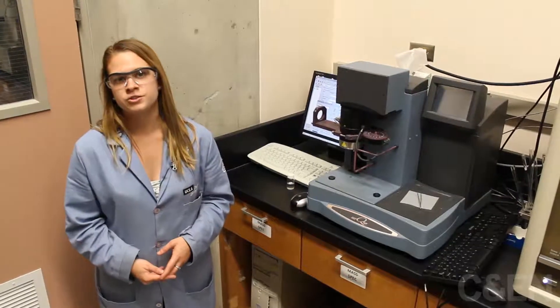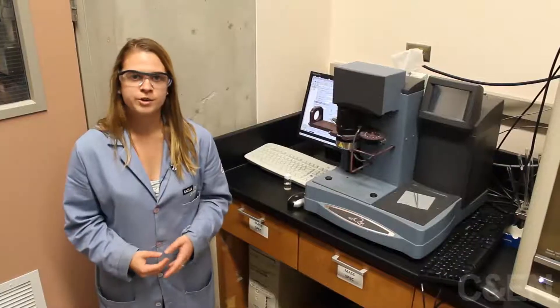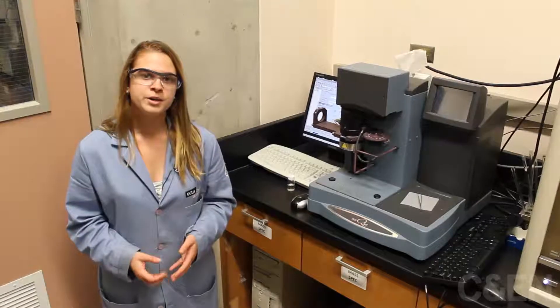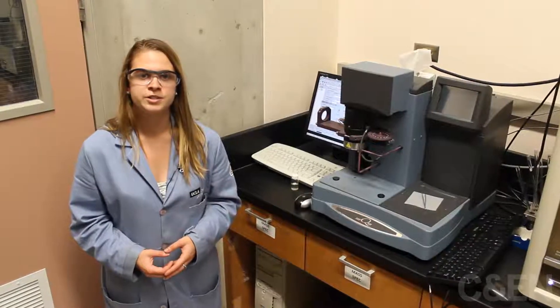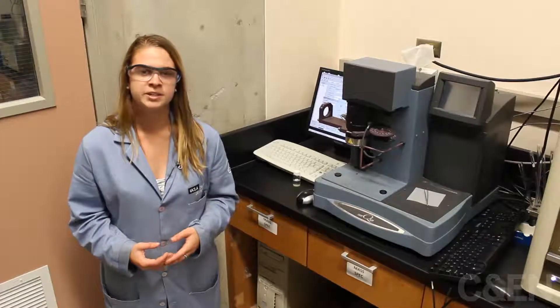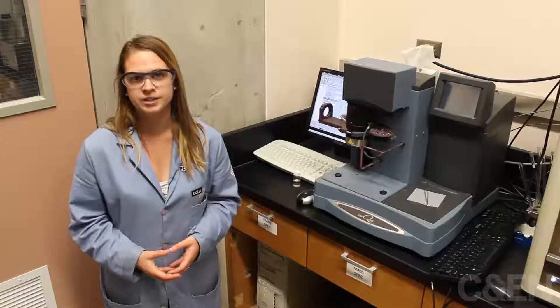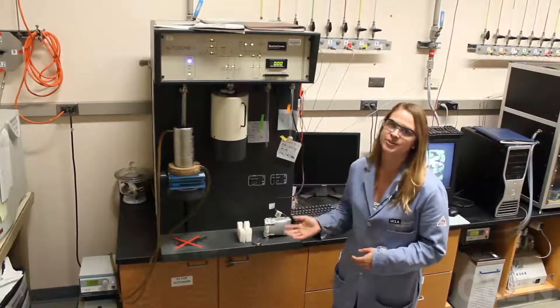After determining the structure of our metal organic frameworks, we can use thermal gravimetric analysis to help us determine the thermal stability of our materials. This is important since we want to use the materials to store gases, and we need to later heat them in order to release the gases without the material decomposing. The instrument behind me here is an autosorb.